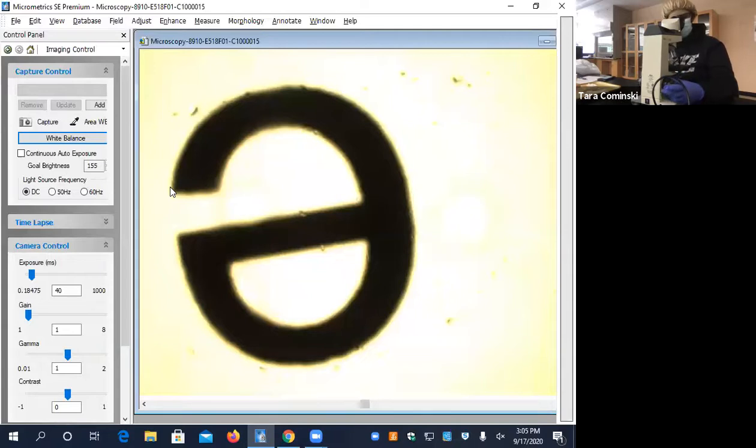It looked like it's focused on here, when I look like this. Well, it looks like it's in the middle, but it's just not in focus, meaning it has to get closer or further away. But it could be slightly off to the side too.